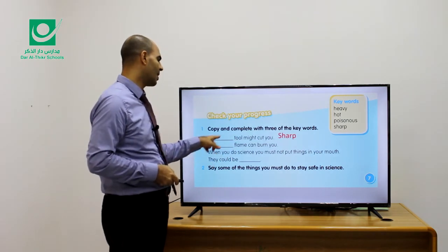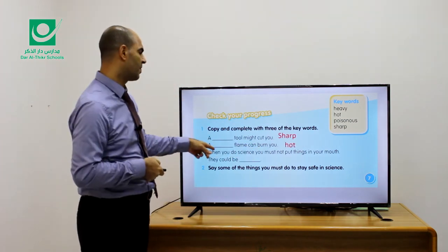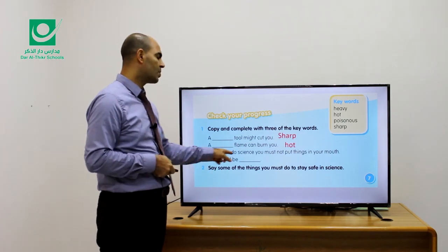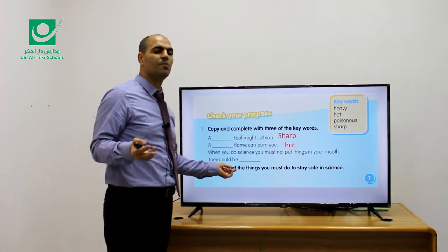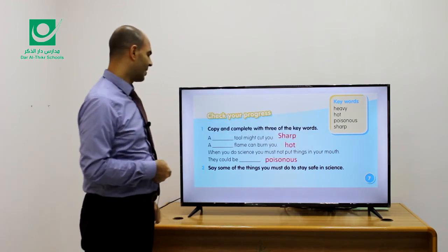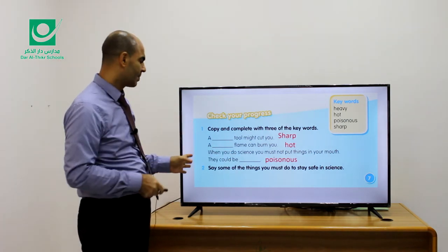The second one, a flame can burn you. Burn. Yes, a hot flame can burn you. Number 3, when you do science, you must not put things in your mouth. Why? They could be, what do you think? Poisonous. So avoid poisonous things.